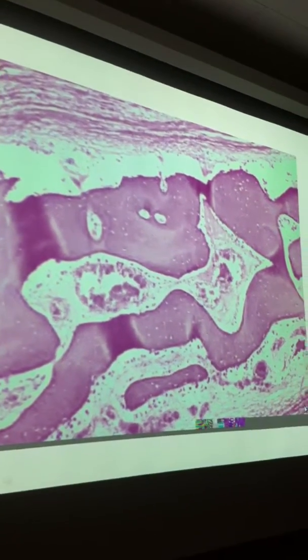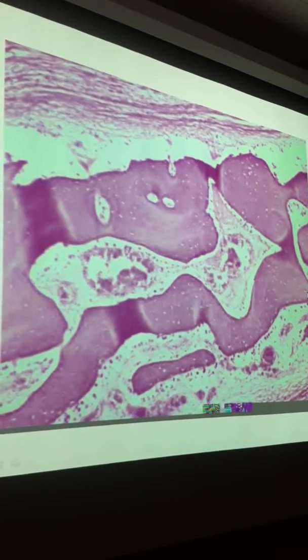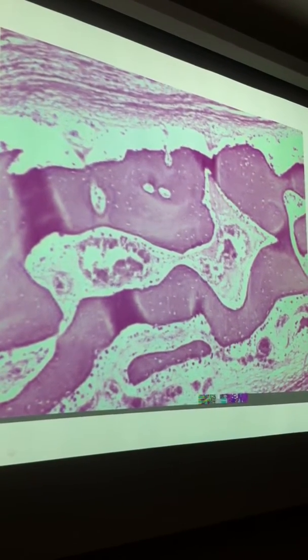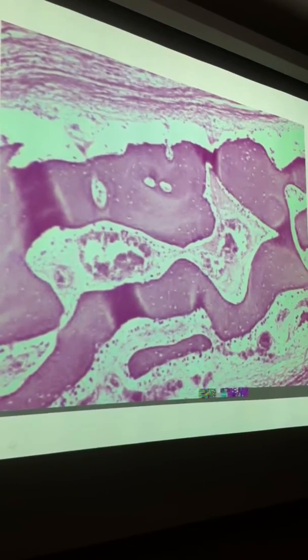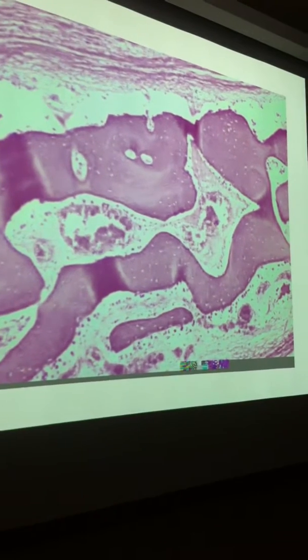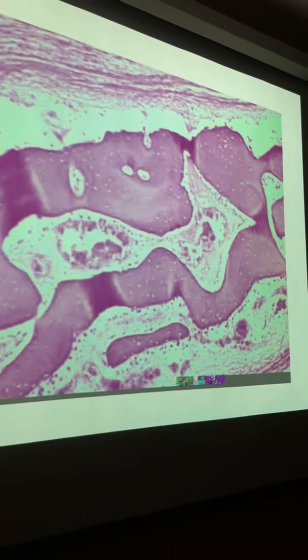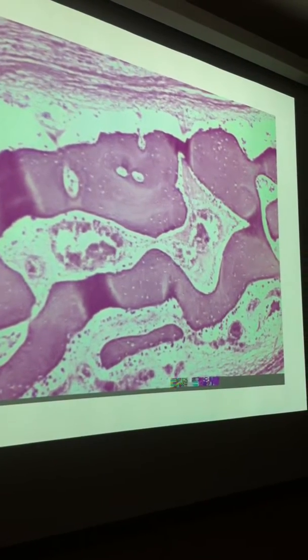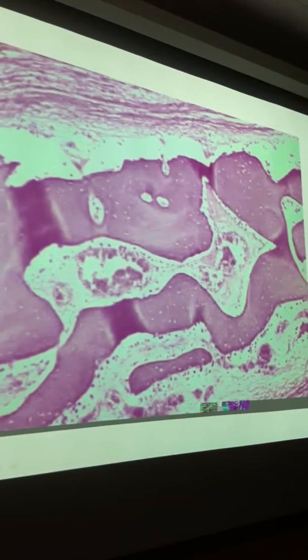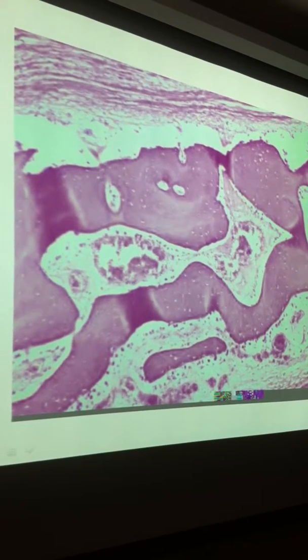Name the tissue in the main field. Jeffrey, what did you say? No, I just repeated what you said. The tissue in the main field. Come on, you can do this, man. Make me proud. I disappoint you. The tissue, just the tissue. I didn't say be specific or anything.